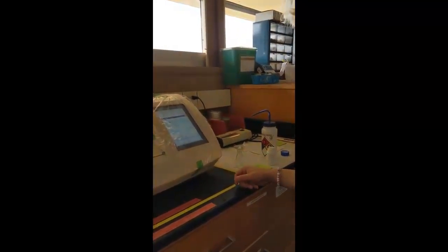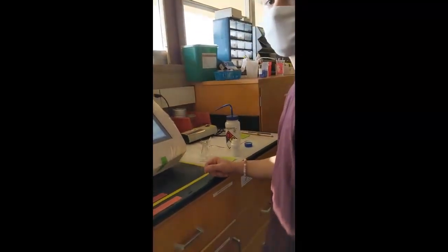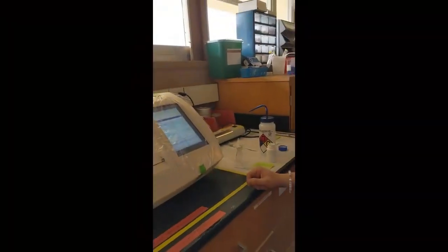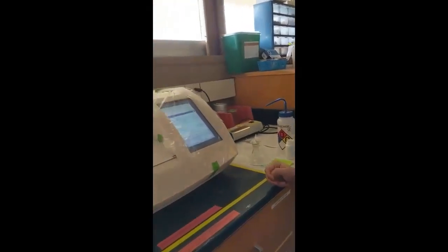Okay. Let's say that you didn't make it out of 100. I make it out of 100 because it's easy. But most of the time you're going to be making it out of like 10 or 200. Just multiply the grams. It's just an equivalence, right? So if you measured 1.5 grams in 10 milliliters, then it's 15 grams in 100, right? So go ahead and hit set.